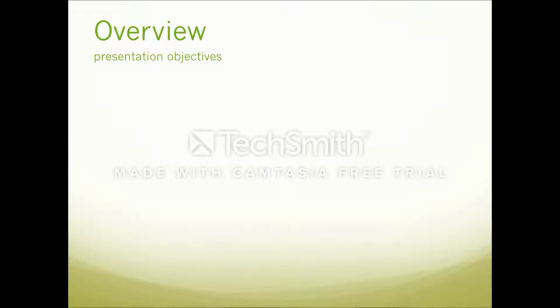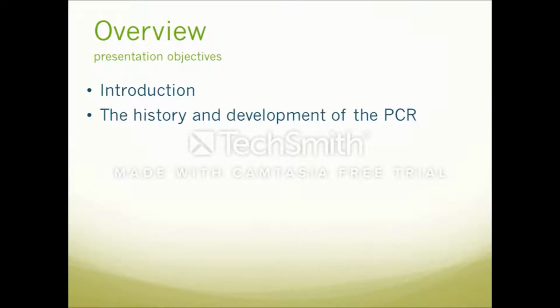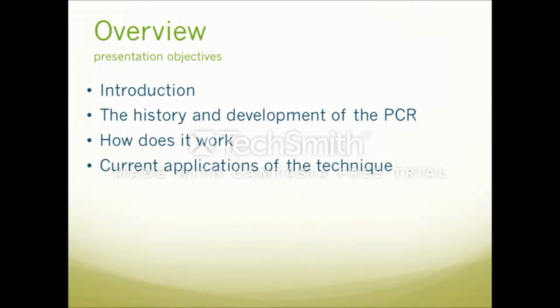So let me quickly show you the aspects that we're going to look at in a little bit more detail along this presentation. We're going to talk about the purpose of the technique in the introduction and what PCR is used for. When it was discovered, how this technique was developed, followed by how does PCR work, its application.